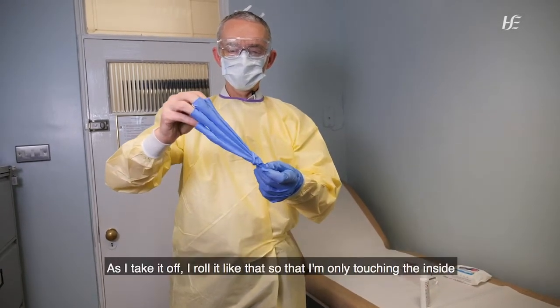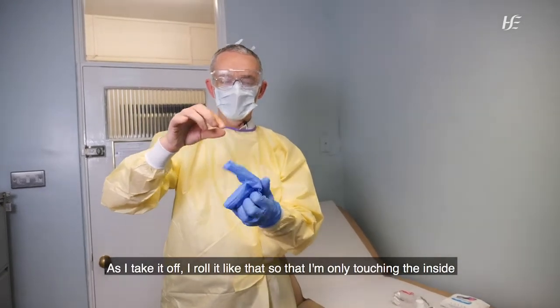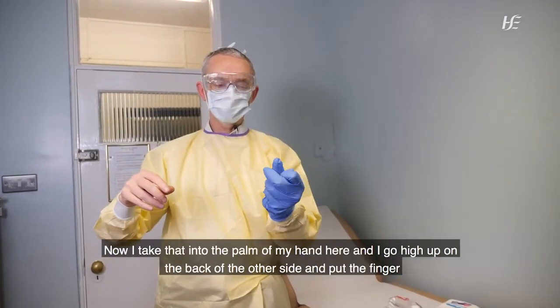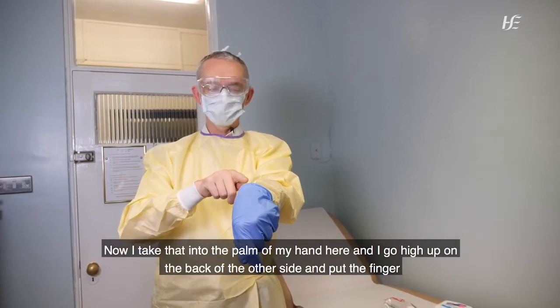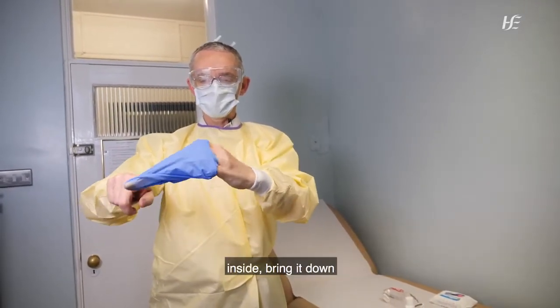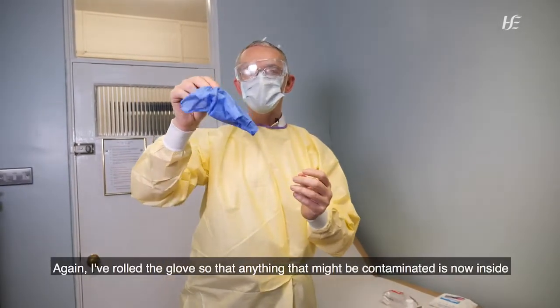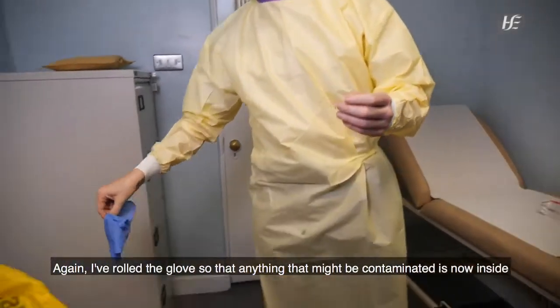And as I take it off, I rolled it like that so that I'm only touching the inside. Now I take that into the palm of my hand here and I go high up on the back of the other side and put the finger inside, bring it down, and again I've rolled the glove so that anything that might be contaminated is now inside.